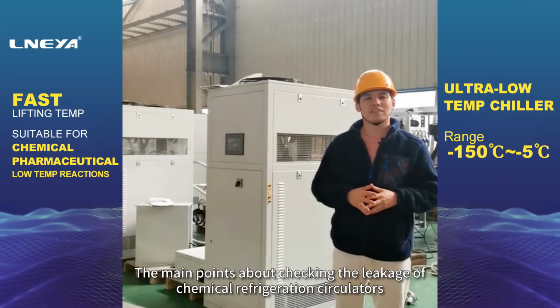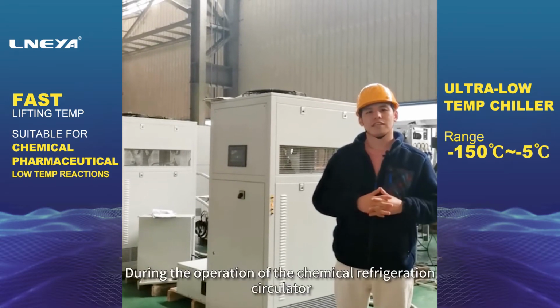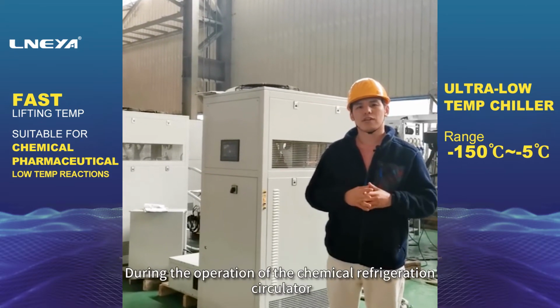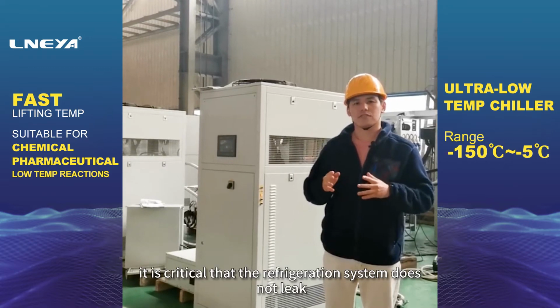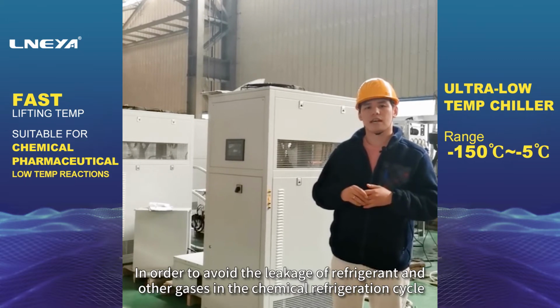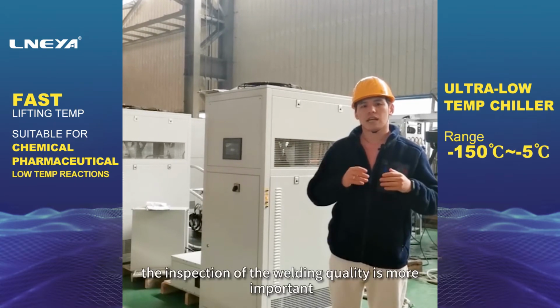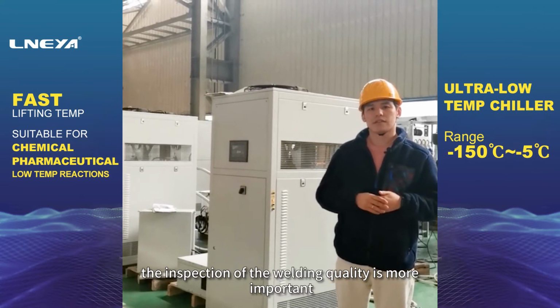The main points about checking the leakage of chemical refrigeration circulators. During the operation of the chemical refrigeration circulator, it is critical that the refrigeration system does not leak. In order to avoid the leakage of refrigerant and other gases in the chemical refrigeration cycle, the inspection of the welding quality is more important.